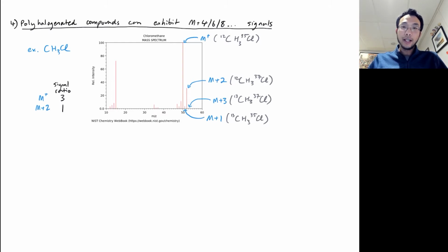Here, that's pretty negligible again because you have 2 low probability events that need to happen in order for such a molecule to exist. So it does happen some small percentage of the time, just insignificant compared to the molecular ion itself.